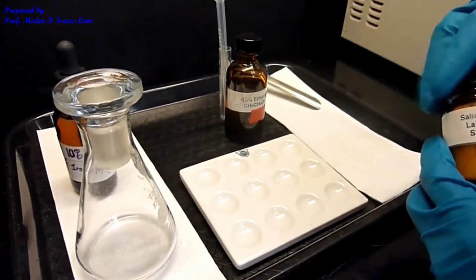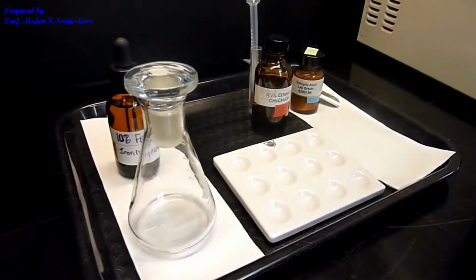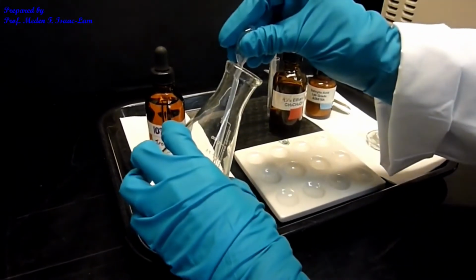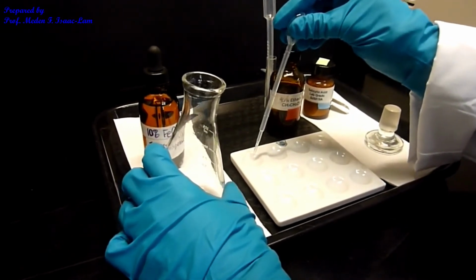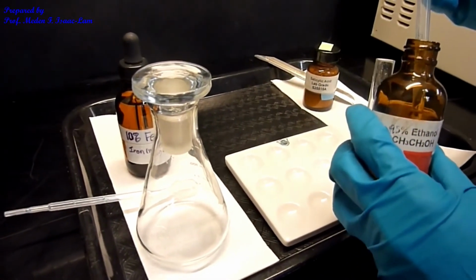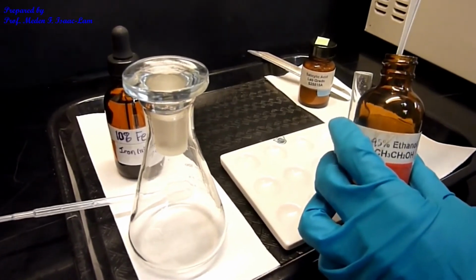And then I'm going to dissolve it in a little bit of ethanol later. So I will put a drop of the reaction mixture in one of the wells. I'm going to put it here. So just a drop. I'm going to dissolve both in a few drops of ethanol. So like 3 drops.